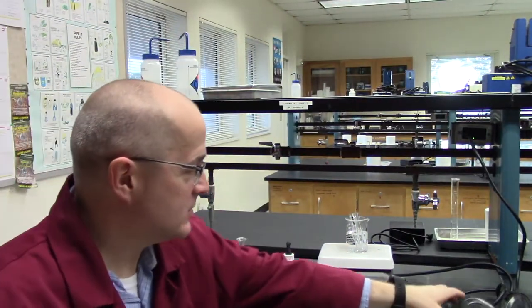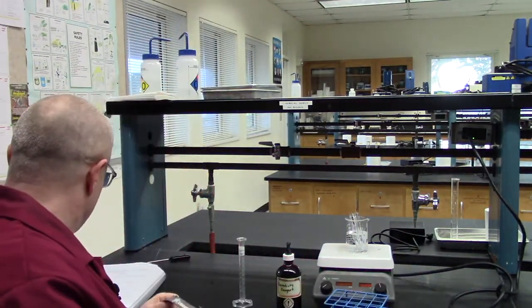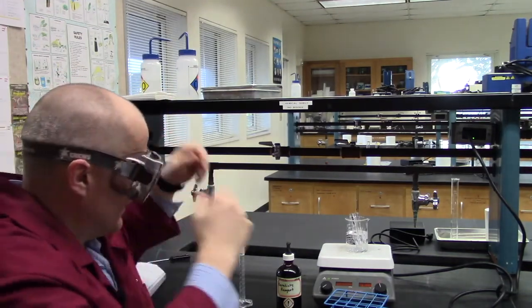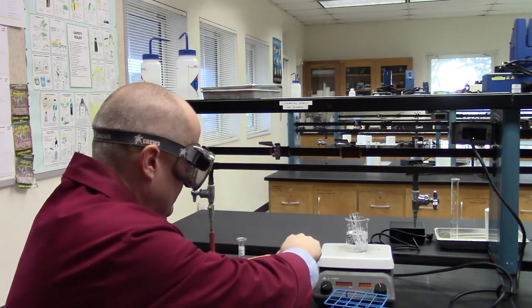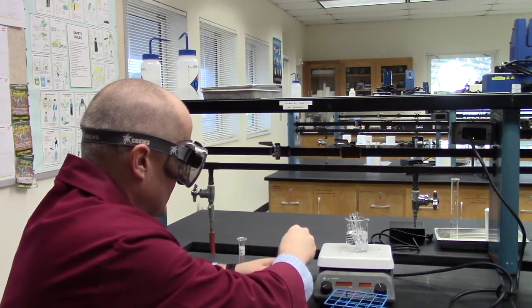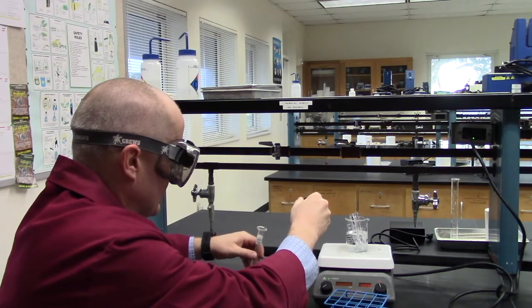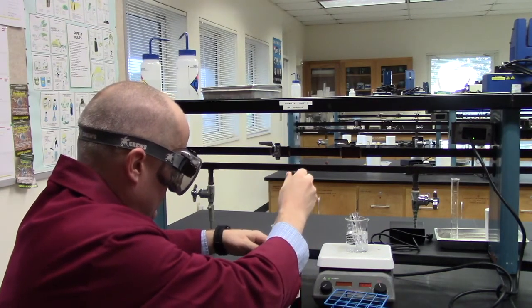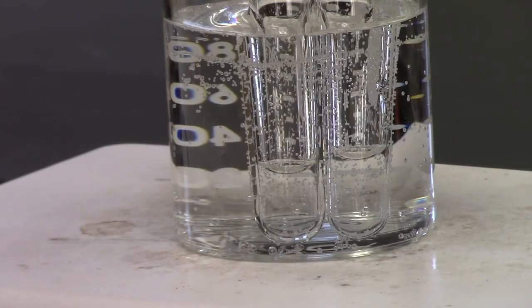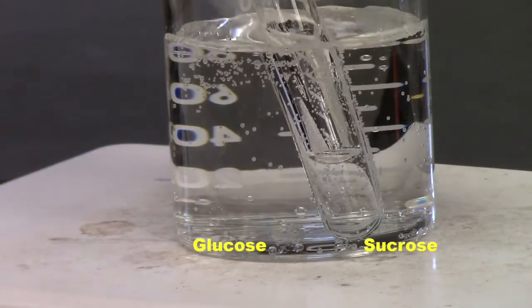So let me get my goggles on just in case. How much Benedict's solution do we need? About 1 milliliter of Benedict's solution. All right. So here we go. There we go. It's a little tight. And we get 1 mil. That's about it. There's 1 mil. So I'll put 1 mil in with the glucose.